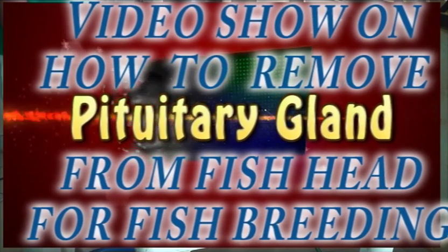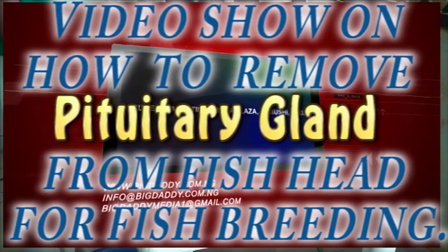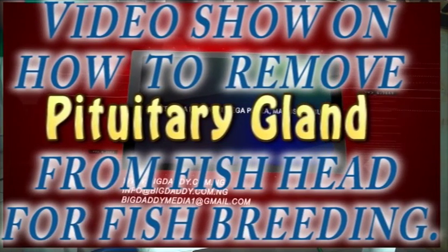Welcome to Big Daddy Fish Farm. This is a training on how to remove the pituitary gland from a fish head.